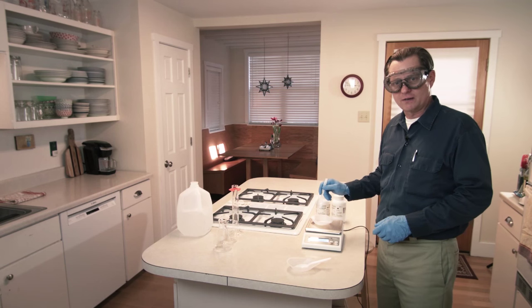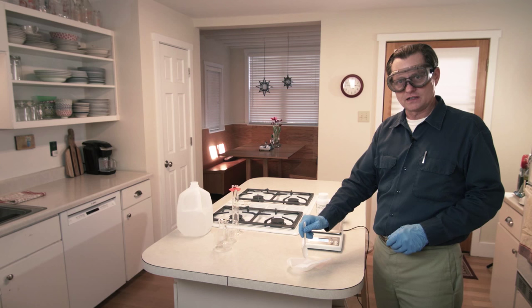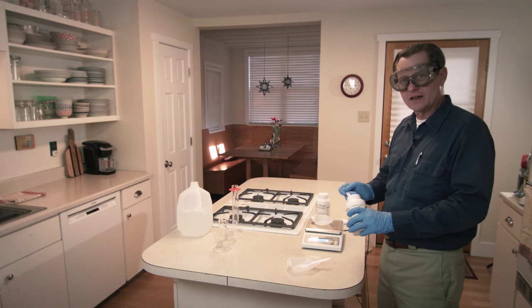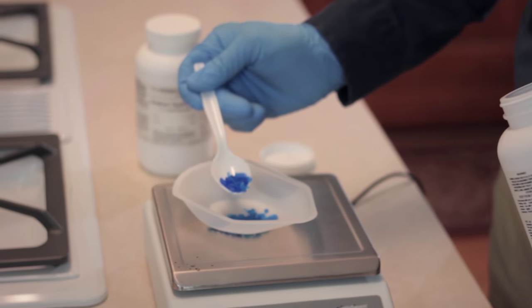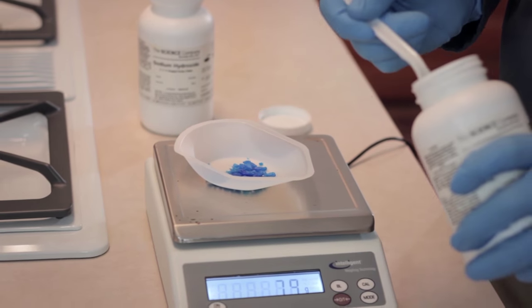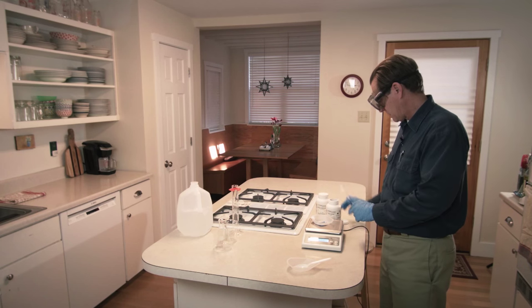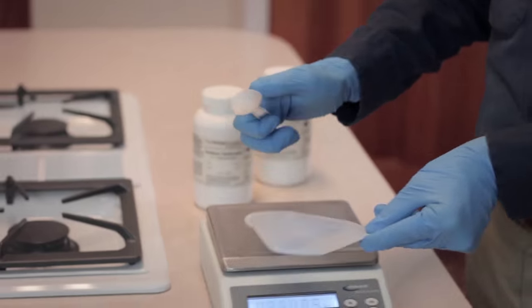I'm going to weigh out 10 grams of copper sulfate and 10 grams of sodium hydroxide. The copper sulfate is not particularly dangerous — it's used in fountains to prevent algae growth. I went up to 10 and a half grams, which is fine. For these experiments, the measurements don't need to be precise, so I've got 10 and a half grams of copper sulfate.